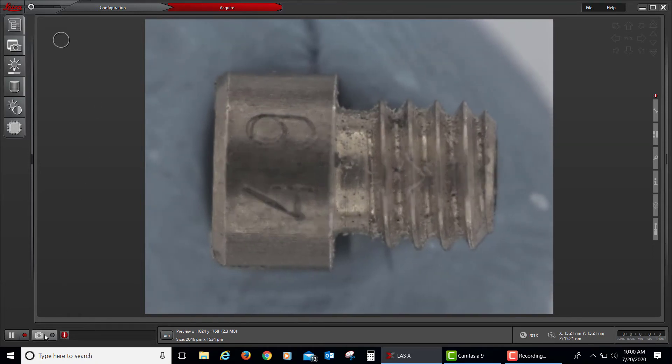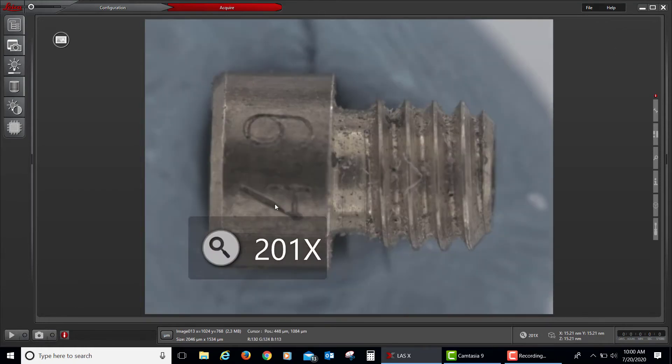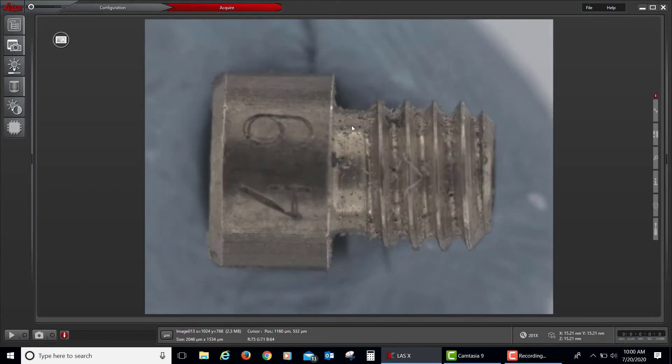So I'm clicking on the button that says Capture an Image, and here is my captured image.